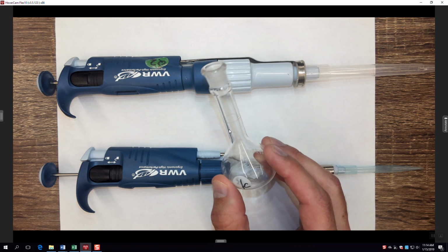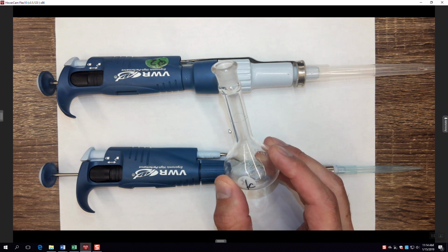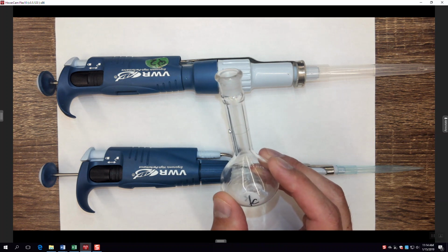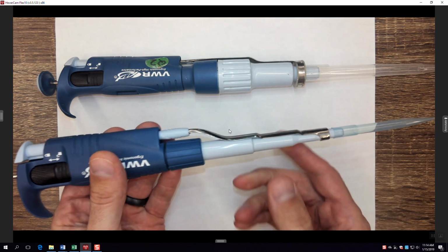So this is the difference between accuracy and precision, and also the ways that these things are calculated. Now that we've talked about these things generally, let's look at what we're actually going to do in the first part of this experiment. And to do that, I just want to bring up the camera.